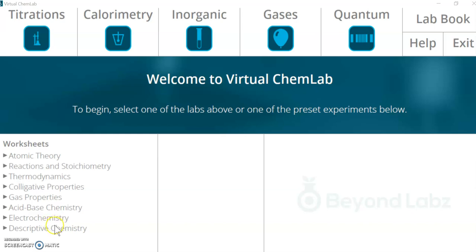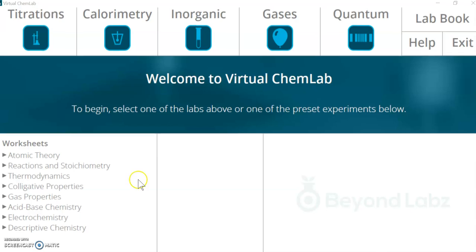Hello, this is Brian, and today we are doing the Beyond Labs lab called Identification of Cations in Solution: Cobalt, Chromium, and Copper.